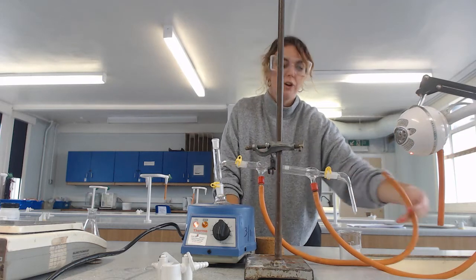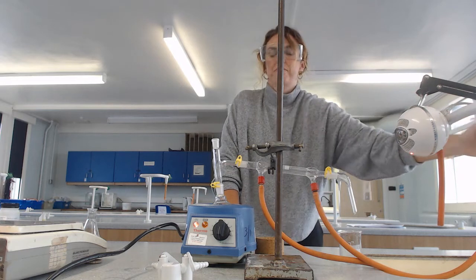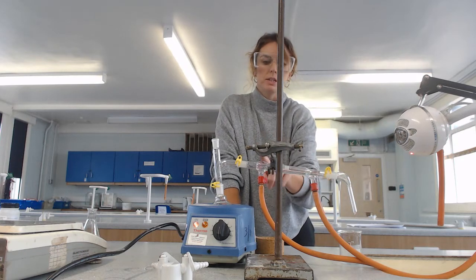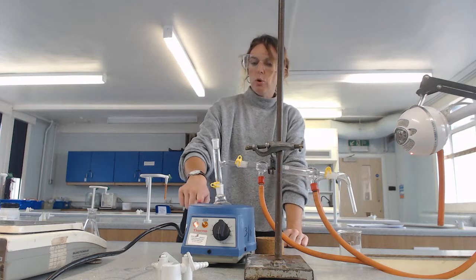The other tube is free and goes into the sink. I can then turn that on — water's going in, nice cold water to condense those vapors.